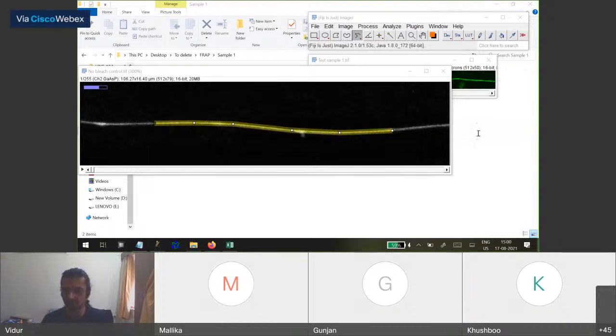I guess everyone has it now. If anyone has any problems, just unmute and speak. Yeah, Vidhur, I think you can continue. Most of the people got it. Okay, sure. So now you can open the file.